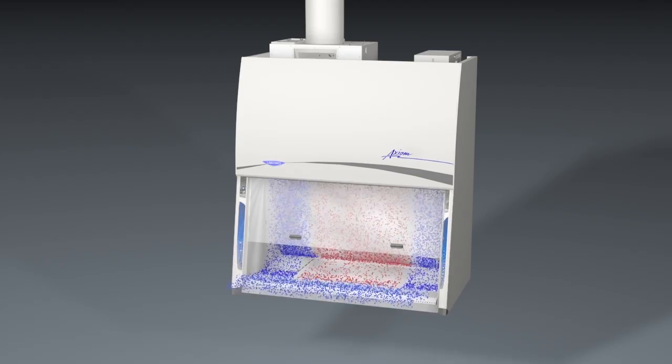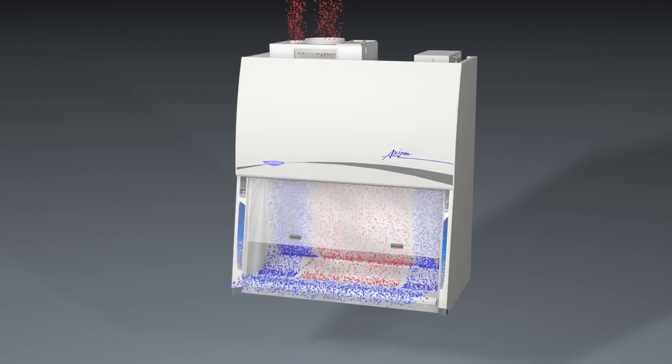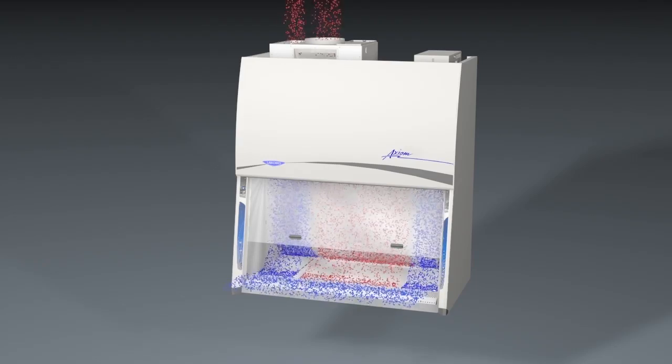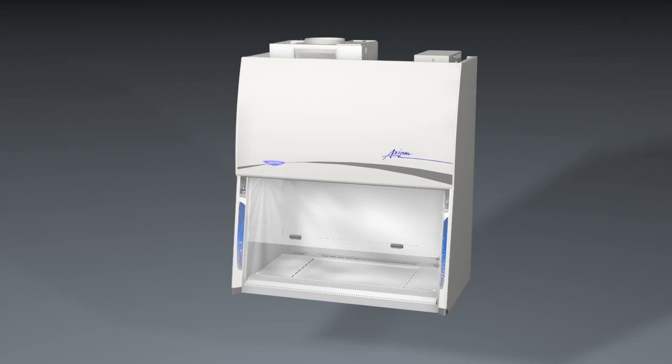This is flexibility that no other cabinet type can offer. Learn more about the Type C1 Purifier Axiom in these related videos.